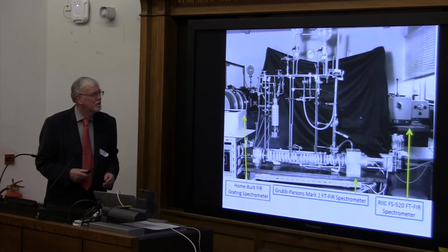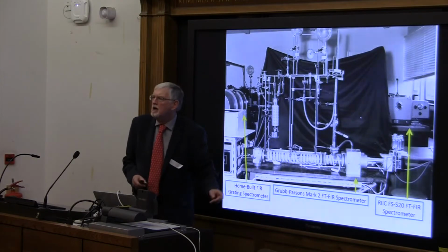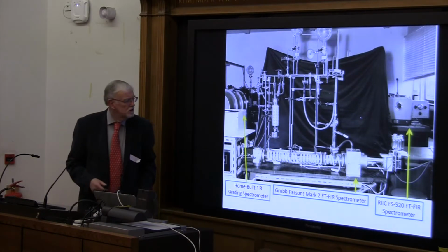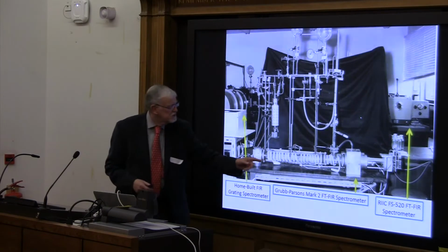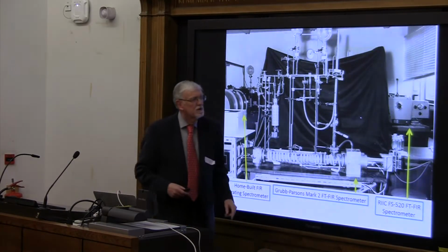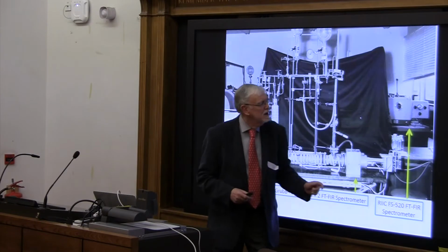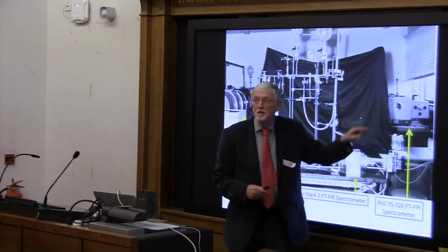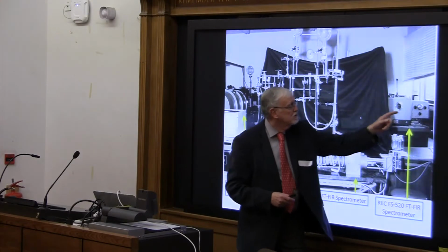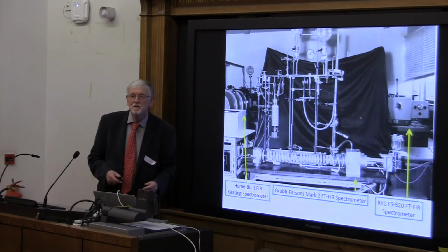This was just a photograph of the instruments in Tommy's lab. This was the NPL cube. This was the higher resolution instrument here. This would get up to about 0.2 reciprocal centimeter resolution. This is actually measuring a heated gas cell here with the detector over here, and the drive was just a standard micrometer drive. Over here, not so easily seen, is the RIC FS520, and this whole big vacuum chamber here, the whole thing was evacuated, to contain the interferometer. These were the control electronics here, and buried behind this curtain with the sampling and detection.